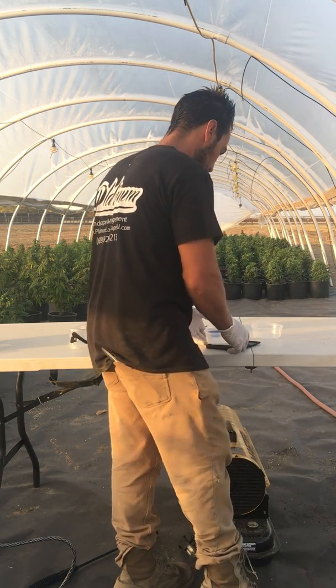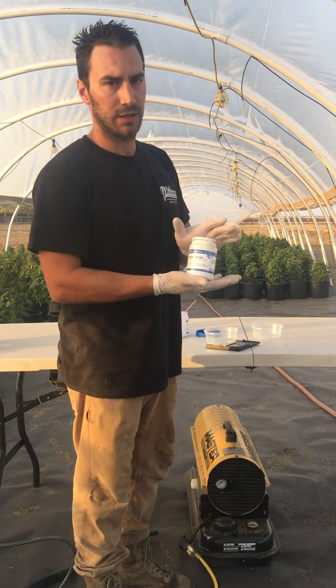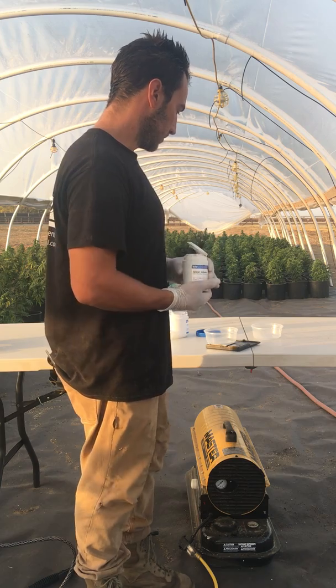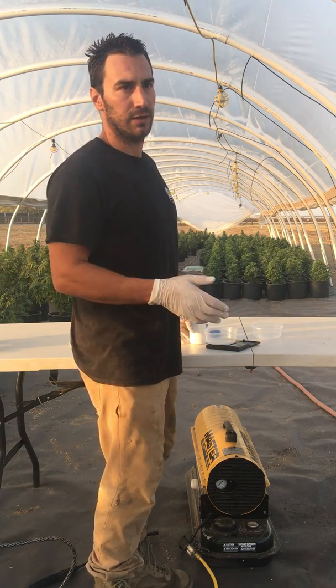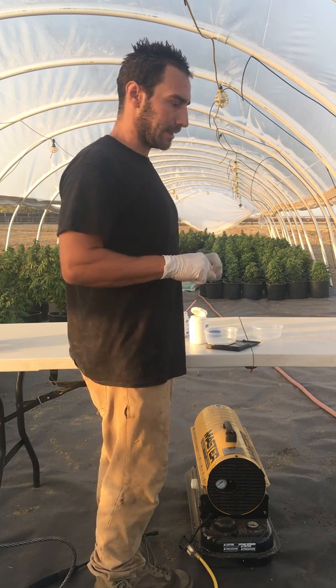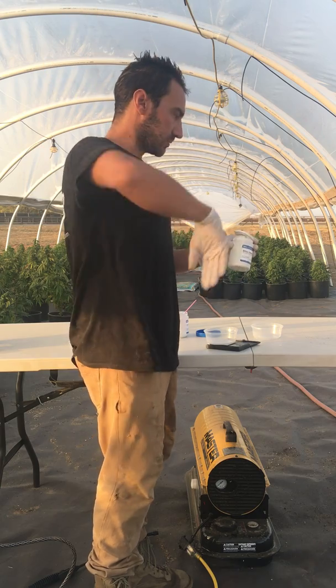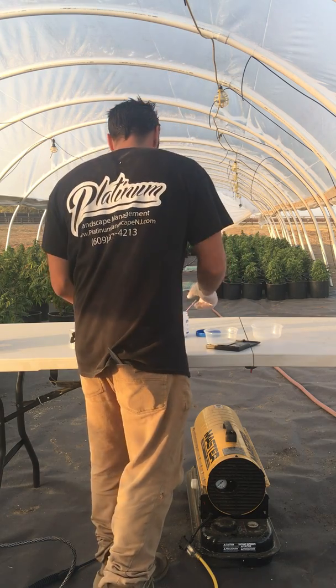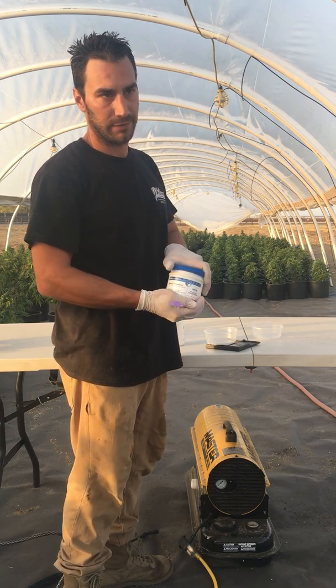I'm going to put one gram of silver nitrate into the other mixture. I'm going to label the two Part A and Part B and then mix them together and add an equal part water. I've been given a lot of misinformation — one time I was told to add five parts water.